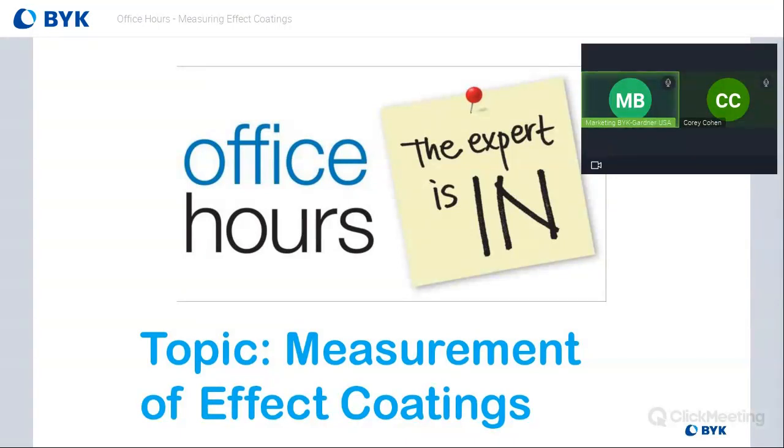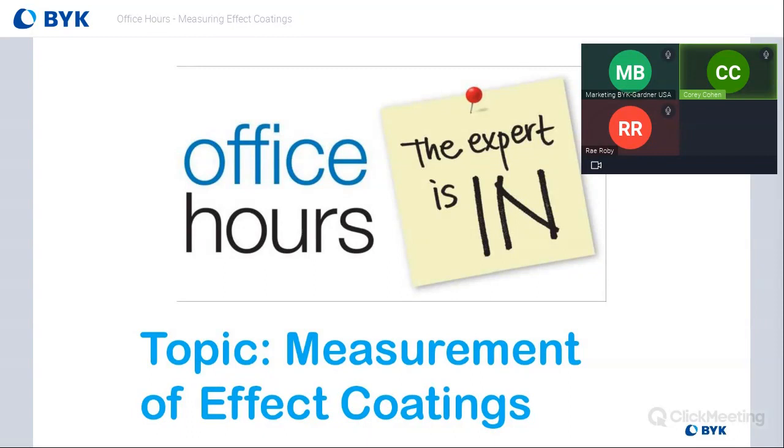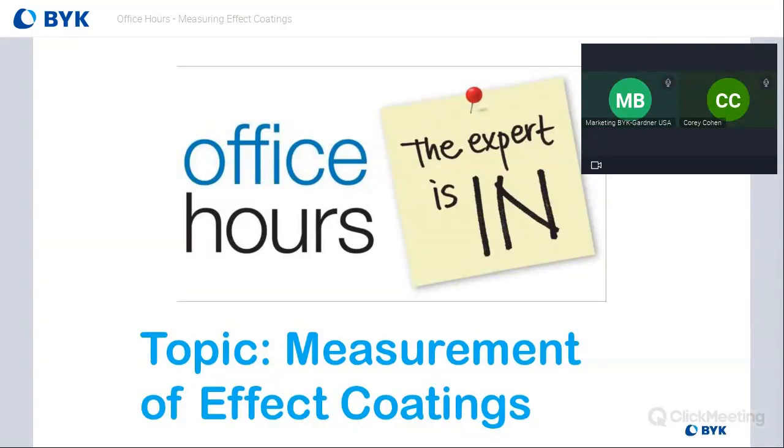So I'm not familiar with those particular terms, wrinkle coat finishes, but if you're dealing with textured samples, a multi-angle spectra might not help you so much. We do have another instrument. It's called the Spectra 2 Profiler, which has some measurements that can actually characterize the grain, the texture of the surface, and help you control that from sample to sample, because that's really important when dealing with textured samples.